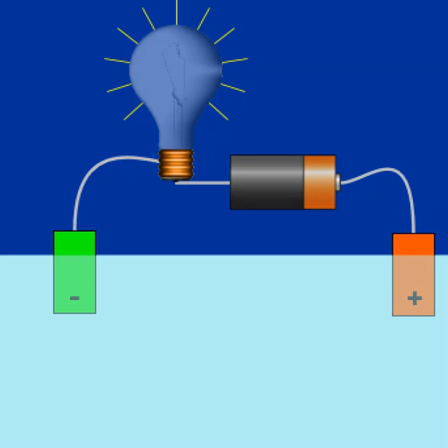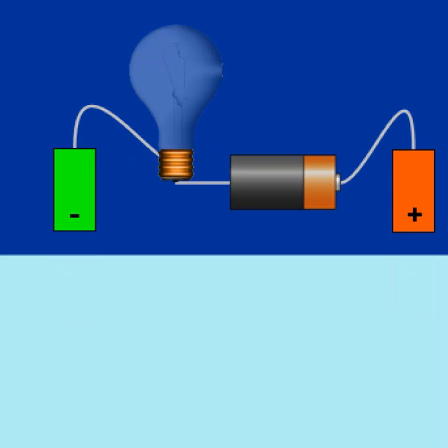Okay, it looks like next we're going to do sucrose. And remember, a little while ago I had the sugar in there, and sucrose is a sugar. It's a covalent or molecular compound, not an ionic compound. So let's switch to the sugar. Okay, so sucrose, again, is a covalent compound. As I showed you before, when it dissolves in water, it just breaks apart into individual molecules, not down to the ions.